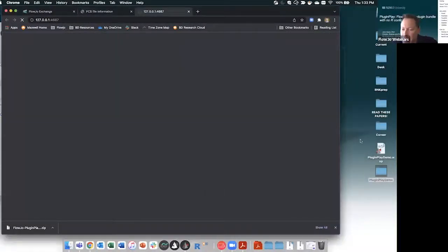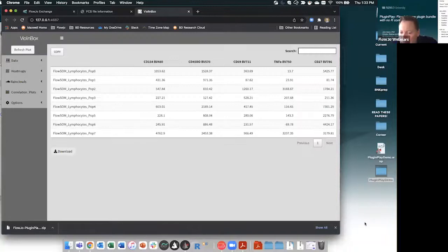That gives me a chance to look at Q&A. How do you know what number to put in the cluster parameters, the FlowSOM bit? For that one, if I have some idea about the data, I might add that. If I don't, knowing the number of parameters and assuming that there could be positive expression and negative expression for each gives me a rough guidepost. And in the worst case, make a guess and then check out one of those larger heat maps at the end to see if the guess seemed reasonable, and rerun it if not. It's only about 30 seconds to make a FlowSOM run. Not too terrible if you run it, go, ooh, not good enough, let me run it again.